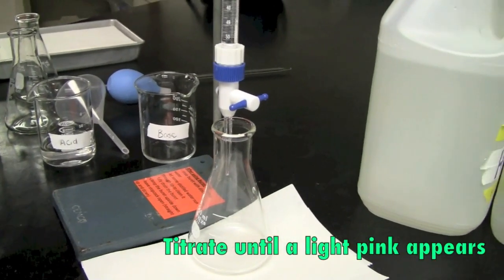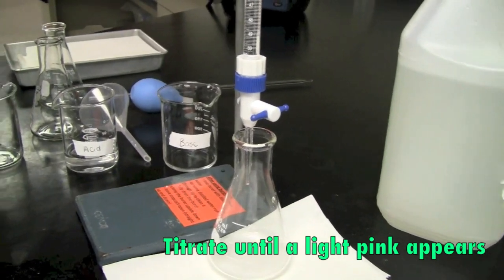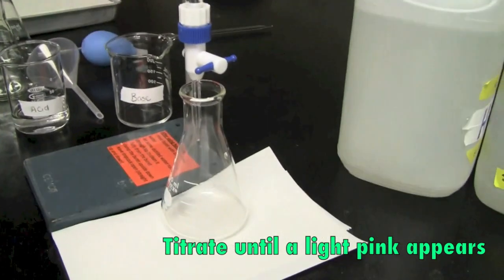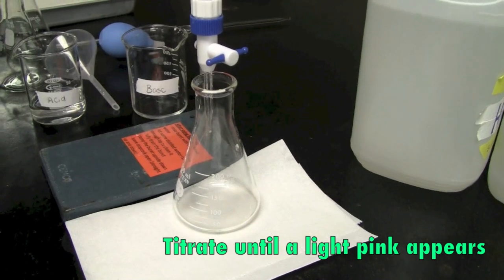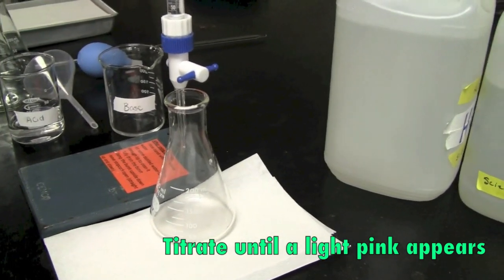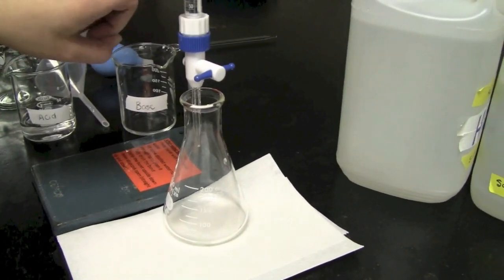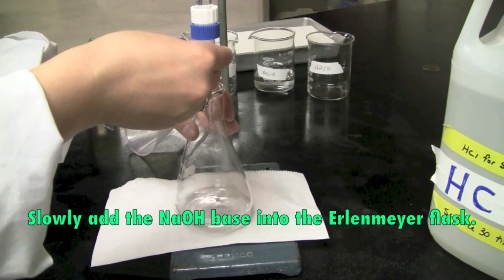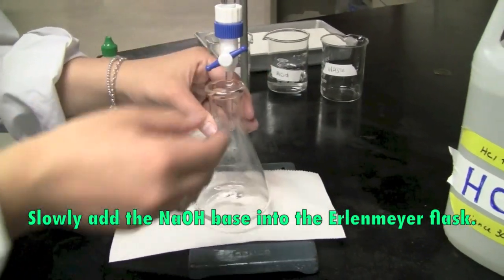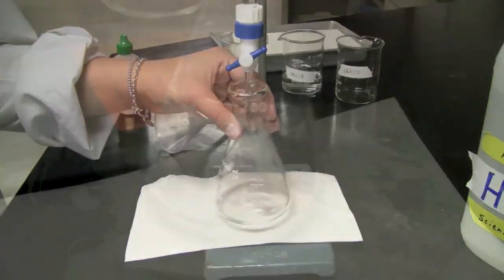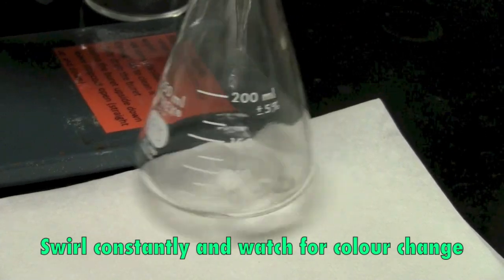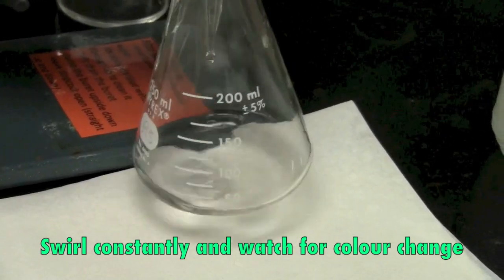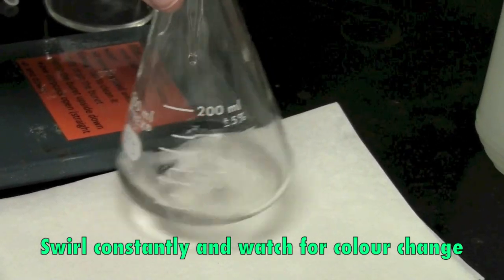So what we're going to do is we're going to titrate until the solution is permanently light pink. So this is going to happen when you add the base into the acid. So remember, when we're adding base into the acid, this is neutralization.